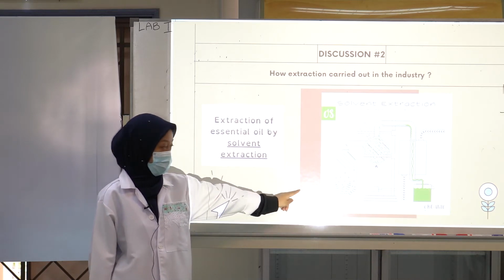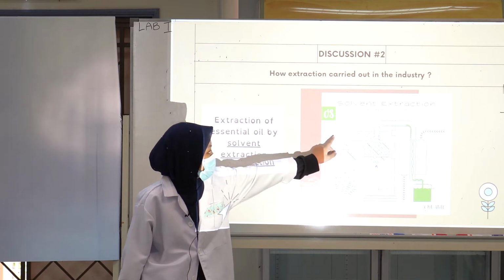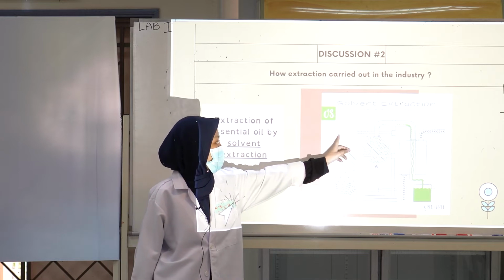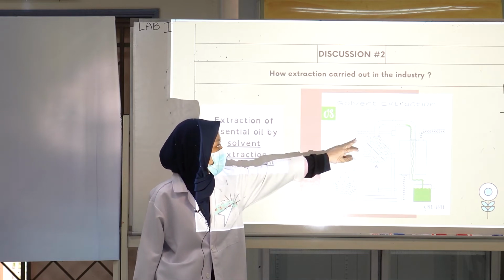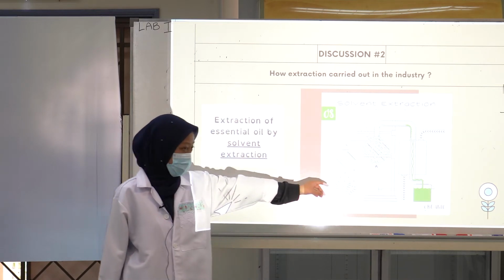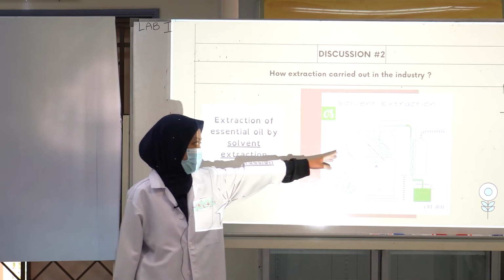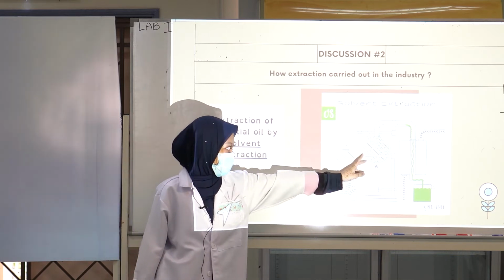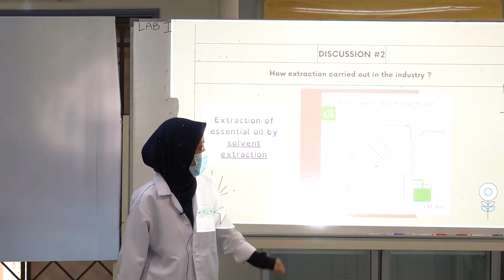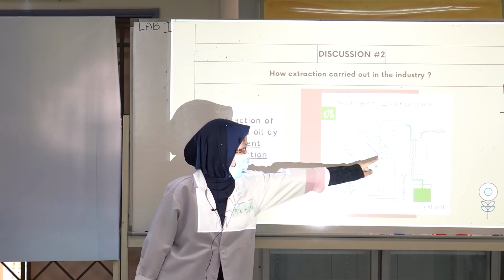After the plant is fully soaked in the solvent, it will evaporate, then go to the vacuum distillation to get the alcohol. It is heated above the vacuum distillation, and after heating up, we get the evaporated plant oil.